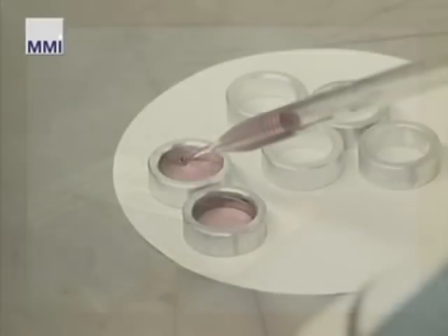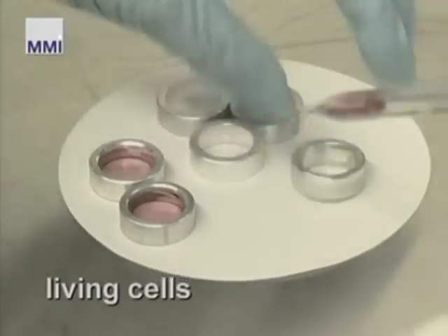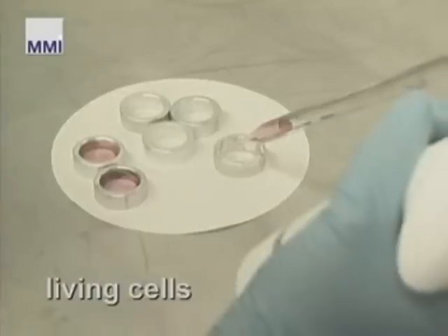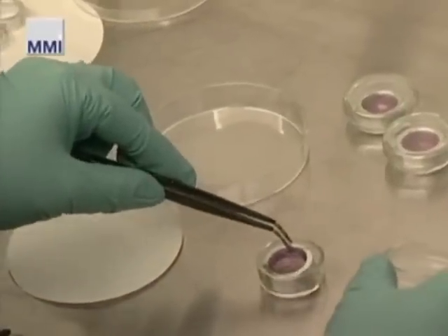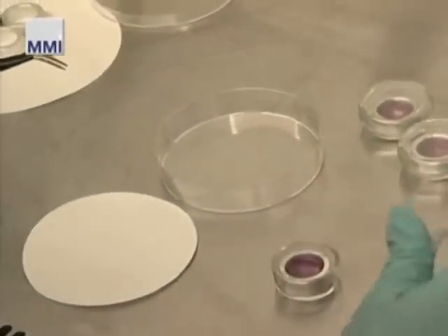Living cells are placed directly in special metal ring frames where they will be cultivated. After the cells stick to the membrane, the metal ring is placed in a specially coated culture dish and inserted onto the microscope table.